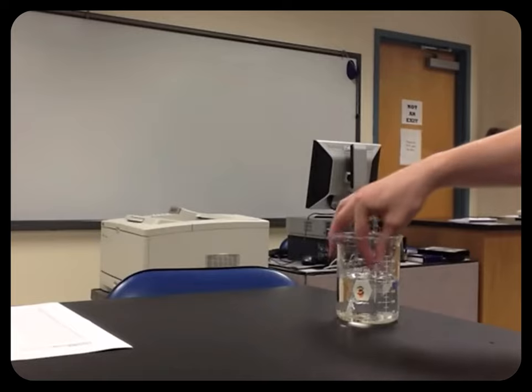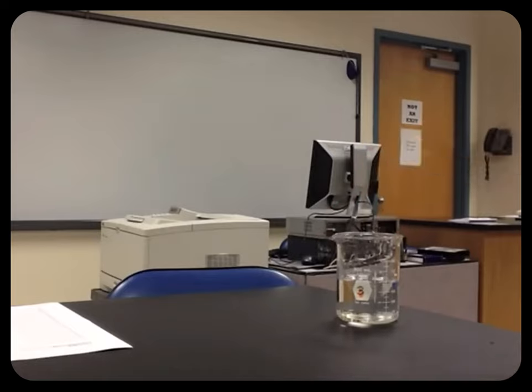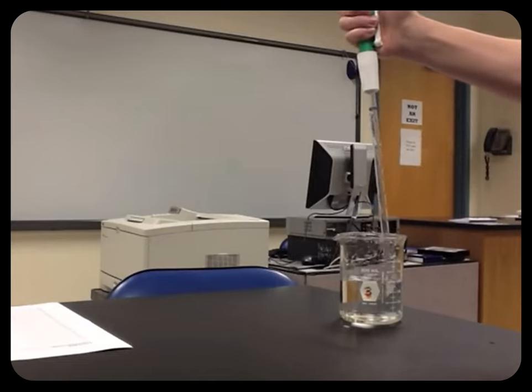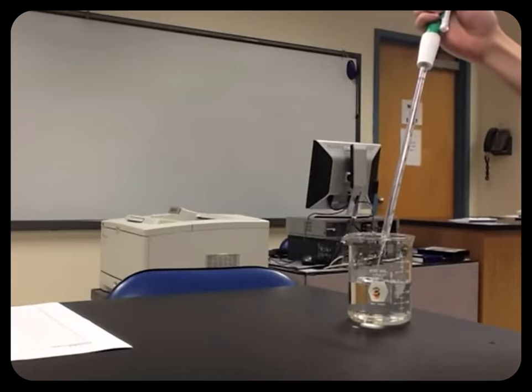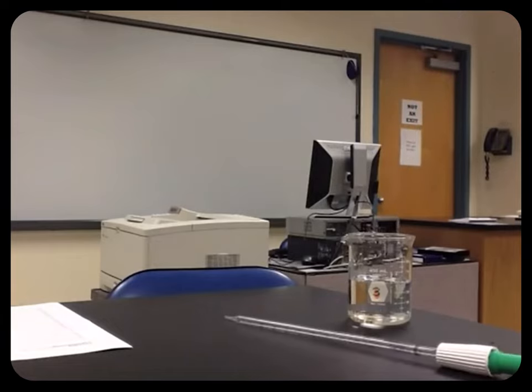And now we're going to repeat this again. We're going to take a tube of dialysis tubing, fill it with 40% sucrose, and put that in the water. If you look at that, the 40% sucrose is the hypertonic, and the water on the outside is going to be hypotonic.